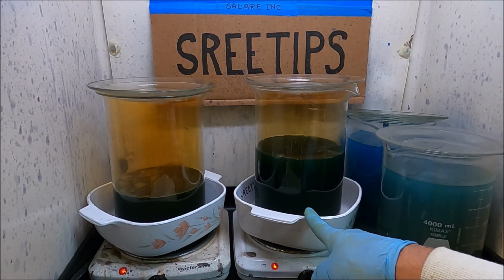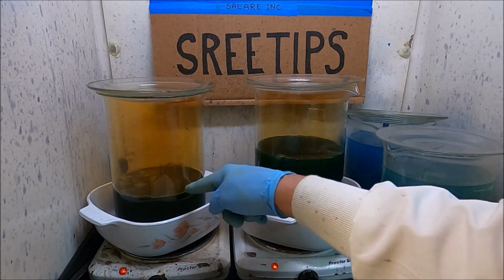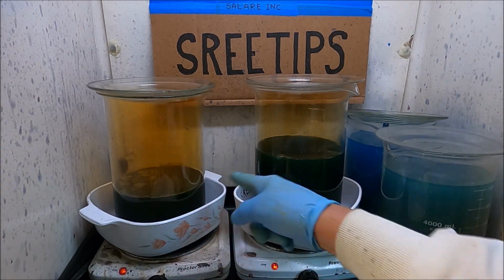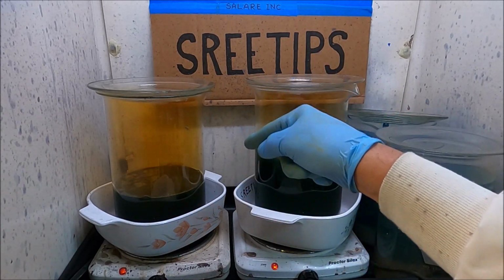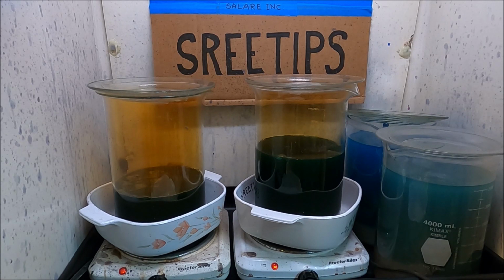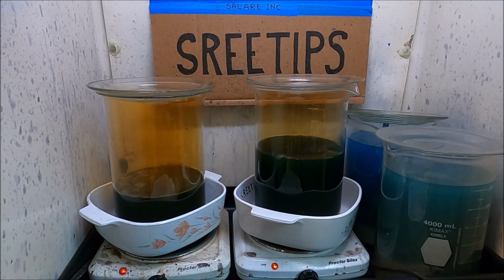The nitric acid in both of these beakers will dissolve any silver that's in these two groups of solids, and it will dissolve off any palladium that's in the solids as well, because palladium is soluble in nitric acid. There may be a little bit of platinum in our solution also, even though nitric does not dissolve platinum by itself. When it's mixed with silver, some of the platinum will go into solution. That's where we're at right now. I've got the heat cranked, we'll let these boil, and then we're going to go from here.